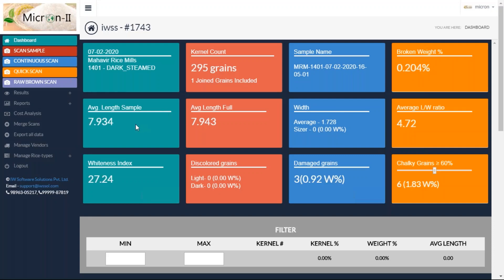7.93 — that's the average length of your sample. If I exclude the broken grains, the length is 7.94. The average width is 1.728, and this is the average LW ratio. There are no discolored grains in this sample. There are three damaged grains and 1.83 percent chalky grains.